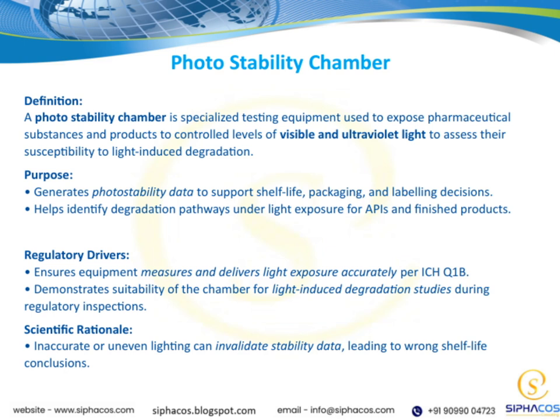Finally, from a scientific point of view, it's important to recognize that inaccurate or uneven lighting can invalidate the stability data we collect. If the lighting isn't consistent, our conclusions about shelf life could be wrong, which could have serious implications for product safety and efficacy. So, in essence, a photostability chamber is a vital tool that helps us ensure our pharmaceuticals remain safe and effective throughout their shelf life, all while complying with regulatory standards and supporting sound scientific research.